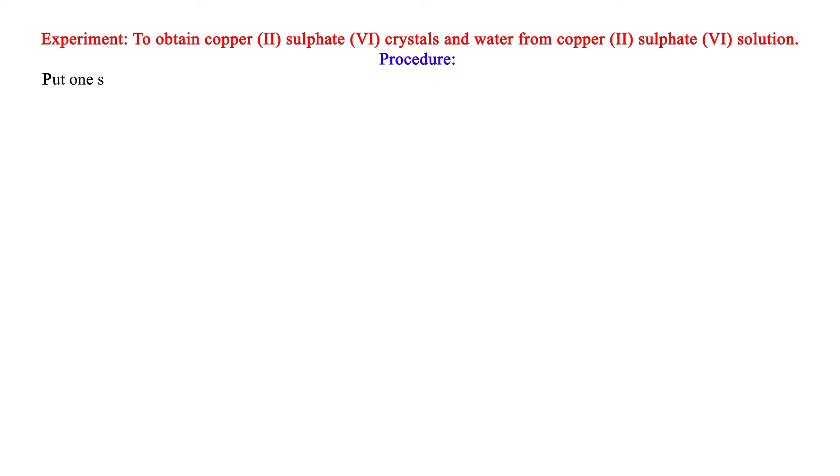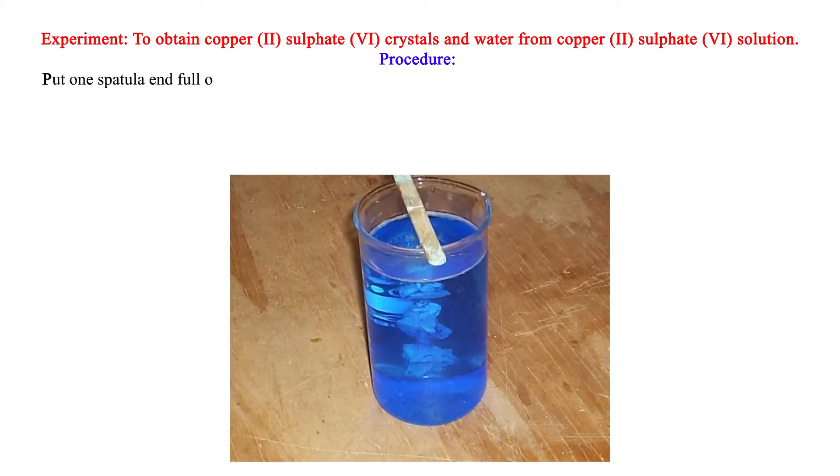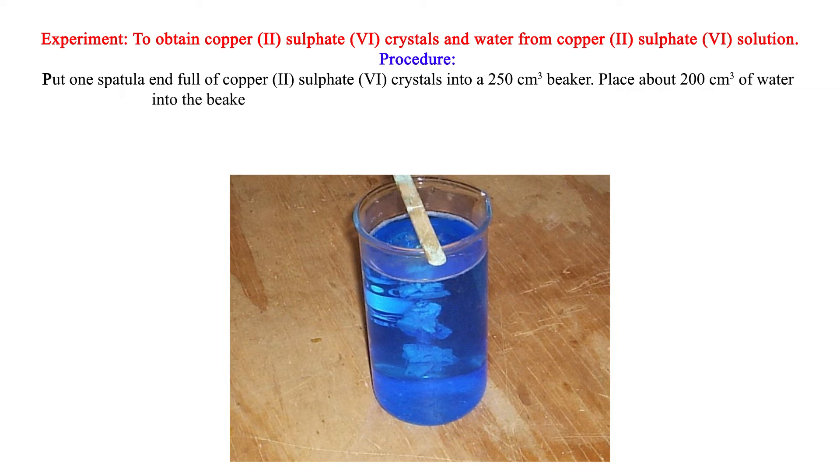Procedure: Put one spatula end full of copper (II) sulfate (VI) crystals into a 250 cm³ beaker. Place about 200 cm³ of water into the beaker.